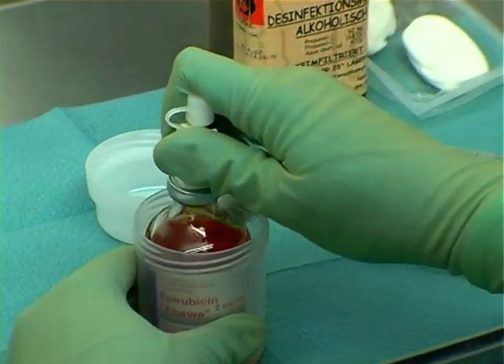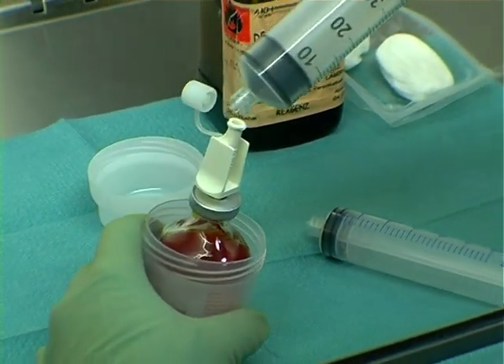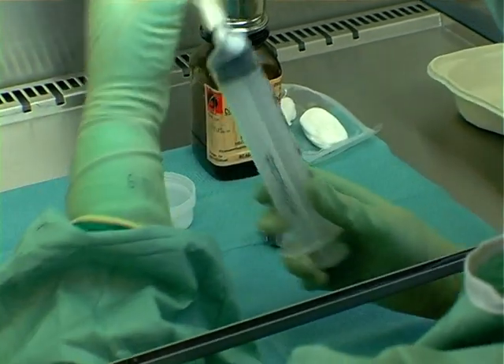Using a spike allows a needle-free drawing up of the stock solutions: applying the spike, connecting the syringe, and drawing up the syringe.